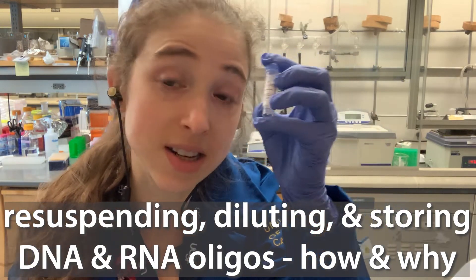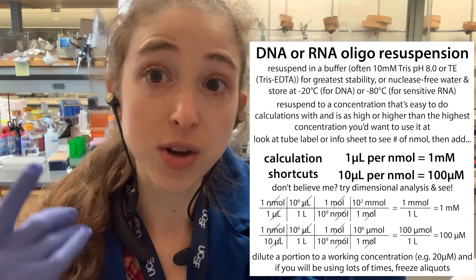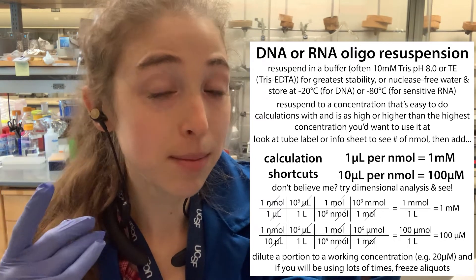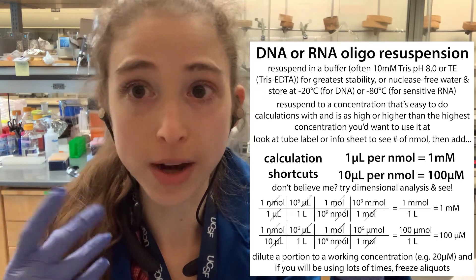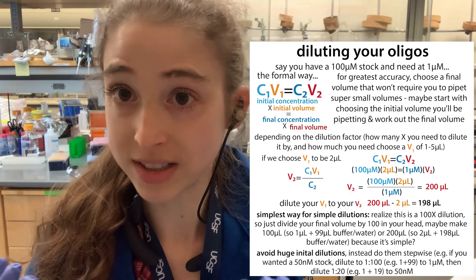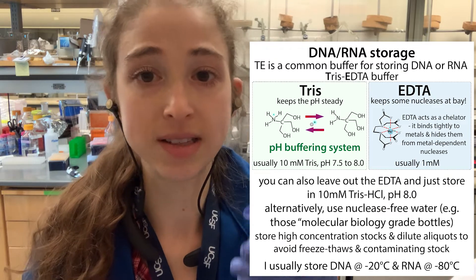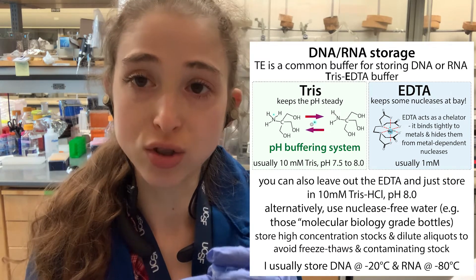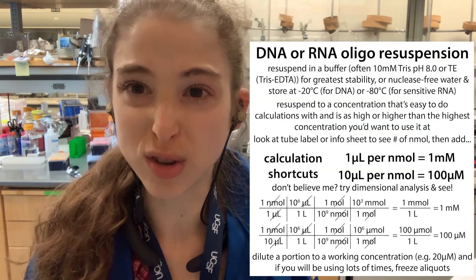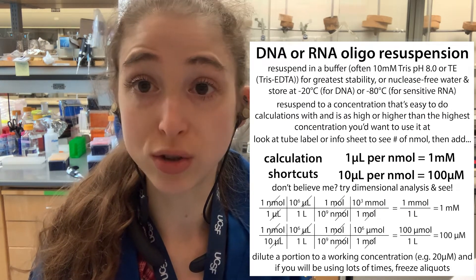I'm anxiously waiting for my primer to arrive, and when it does it's going to come in a tube like this and I'm going to have to dissolve it. A quick tip: you can add one microliter per nanomole for a one millimolar solution, or 10 microliters per nanomole for a 100 micromolar solution. Then later I can dilute that to get my working stocks and keep aliquots. So there are various aspects of dealing with resuspending and storing DNA or RNA — like an oligonucleotide, a short piece of DNA or RNA.